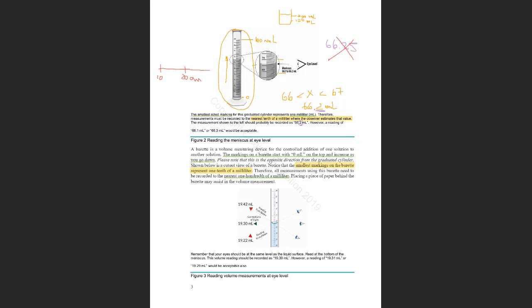It goes by 10. I have something that ends here. I know that my value is between 10 and 20, and I have to guess.